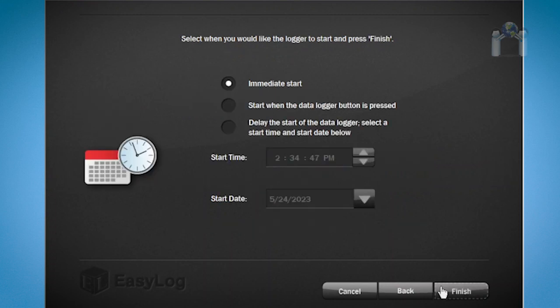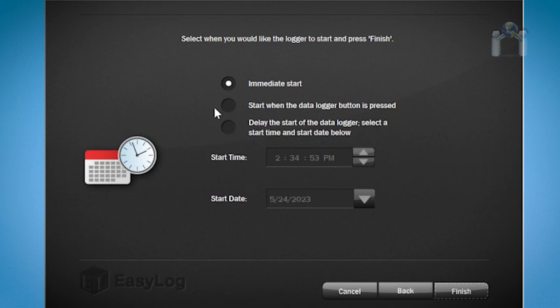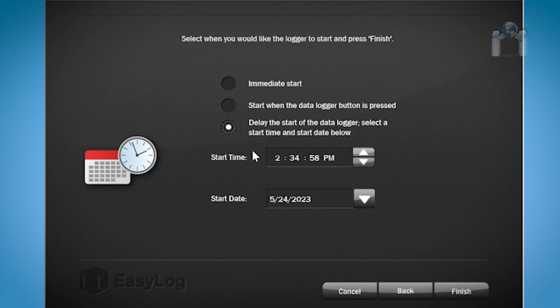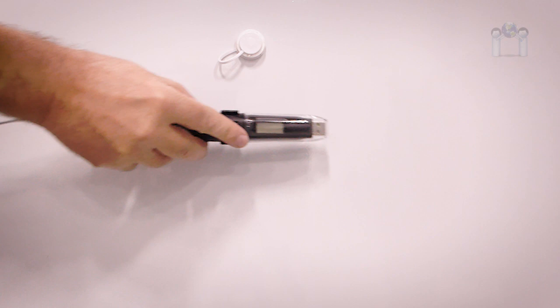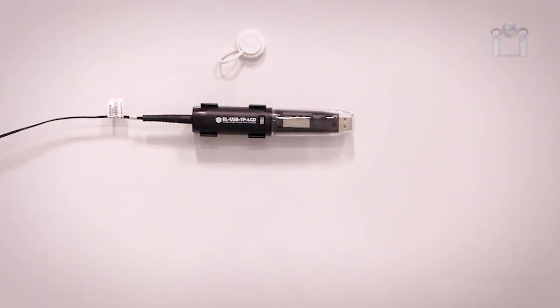Finally, you will be prompted when you wish to start the data logger. You can choose to start immediately, when the button is pressed, or at a specific date and time. If you choose to start immediately or push of the button right before you place the data logger into the recording location, there is a chance there will be an immediate alarm because the logger has not had a chance to adjust to the environment. That said, I will choose to start the data logger in an hour. You can now safely eject the thermometer from the USB port and place it into the desired location.